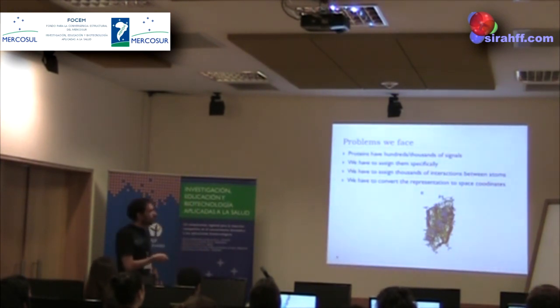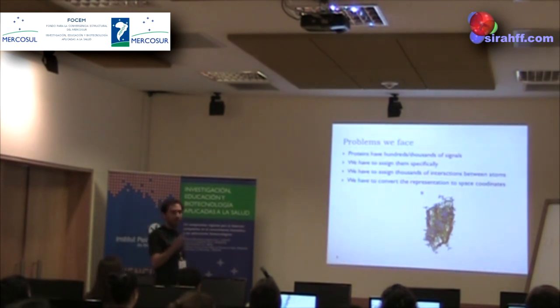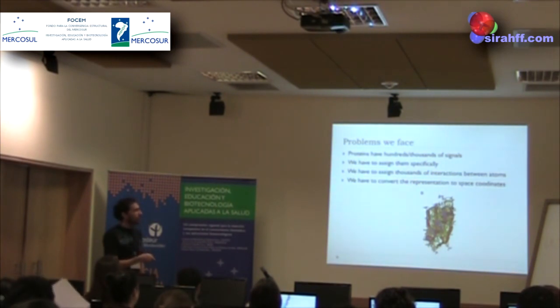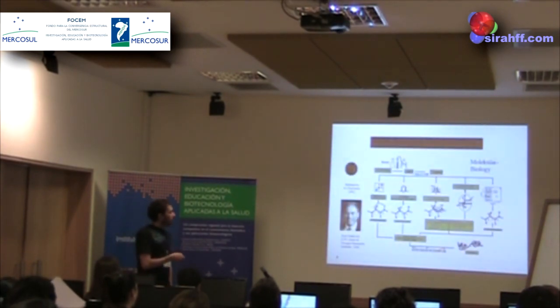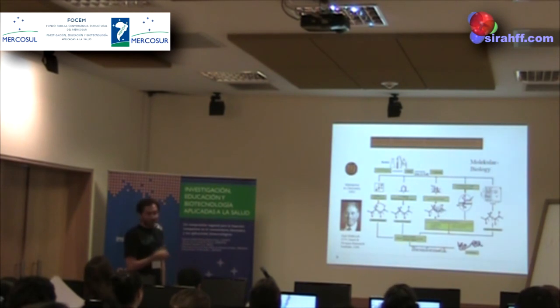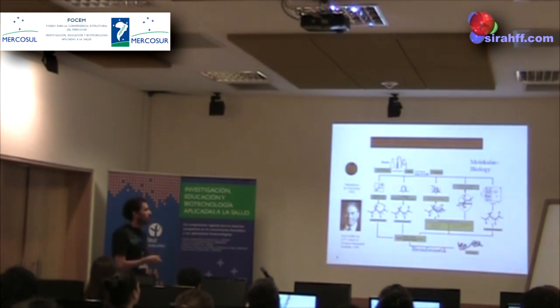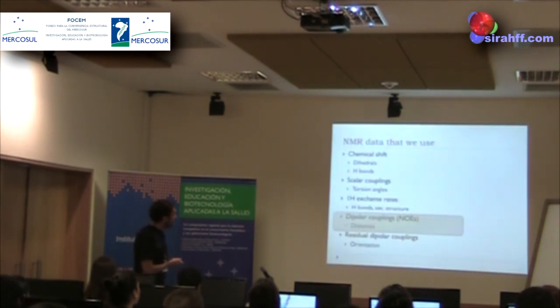So every atom will interact with each other. Now we have to assign these interactions. Well, not only the signals, but the interactions. And this is way more difficult than this, right? And we have, after that, to convert the representation to space, all these things. This is a very difficult task, and we got another Nobel Prize for defining the way to solve structures using NMR.